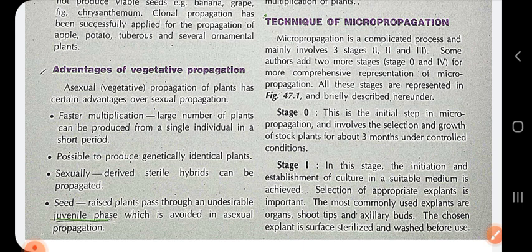And we're actually trying to adjust the environment of that plant so that it can grow well. The young part, the newly formed part of the plant, is generally used as explant, which are actively dividing growing cells, especially the meristematic regions like apical meristems, then the axillary bud, which is also rich in meristematic tissues, right? Just before the root tip, there is also a meristematic region that can also be used to generate callus.